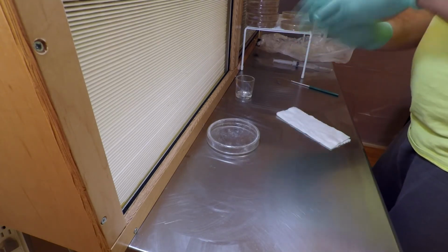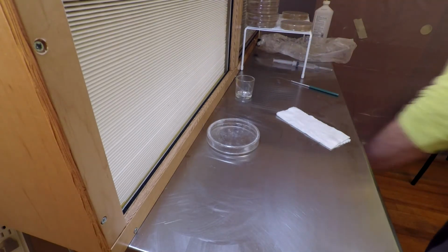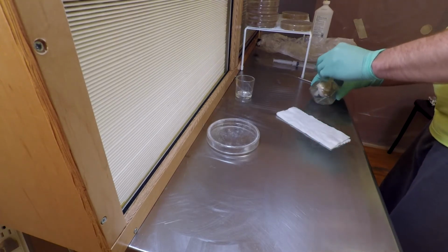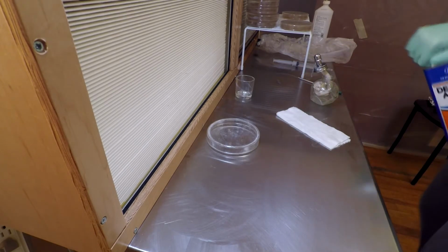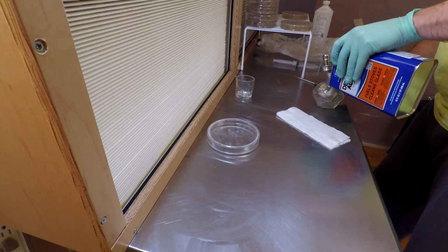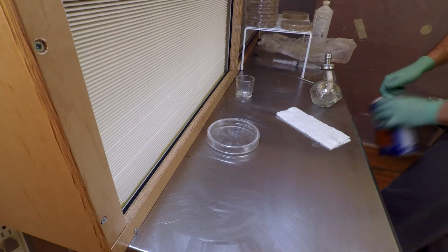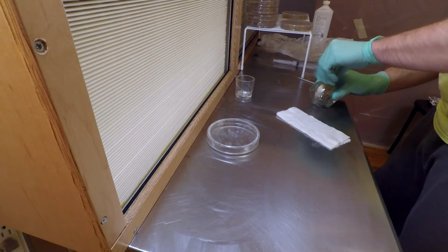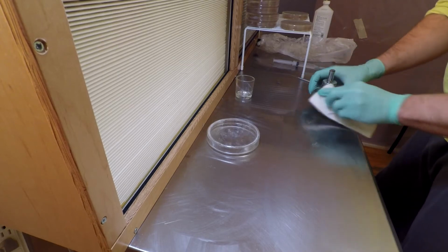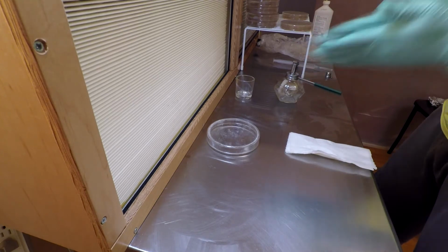Actually, no, what am I thinking? I still need that lamp. I gotta sterilize the inoculation loop. Well, I definitely need to add more alcohol to this. I don't know what I was thinking. A little bit of a dry off.